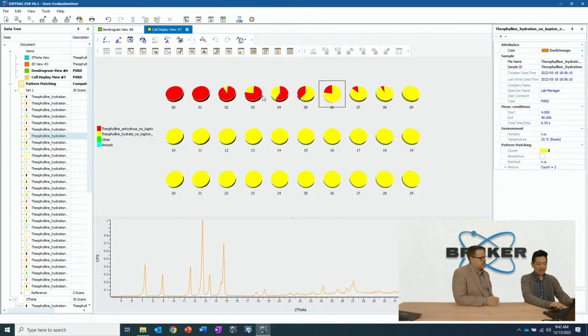So I can say that this takes about 9 scans, or if these were 2 or 3 minute scans, probably about 20 minutes. Yeah, and if you're looking at something like minerals, you could do a similar thing. You just have to bring in a perfect pattern of each of those components. And then it'll tell you the amounts.